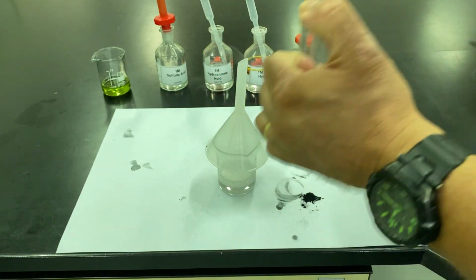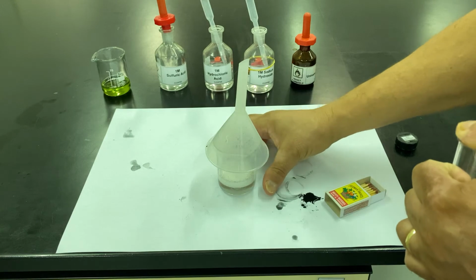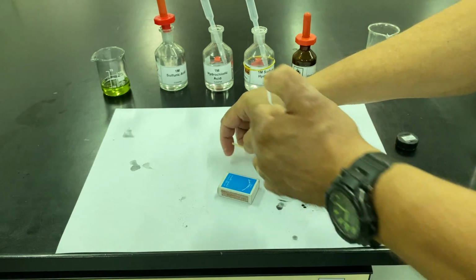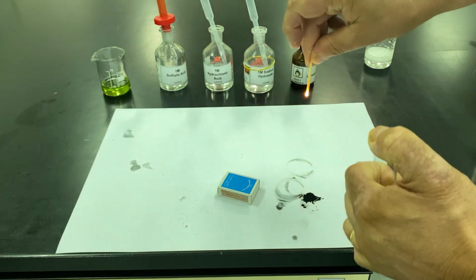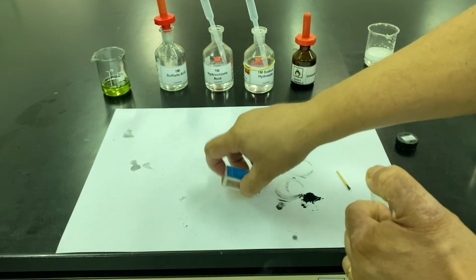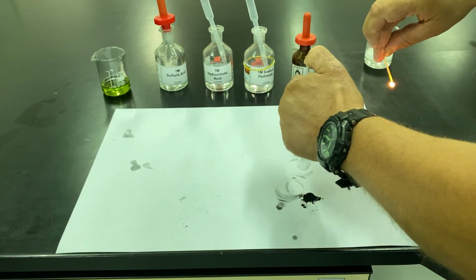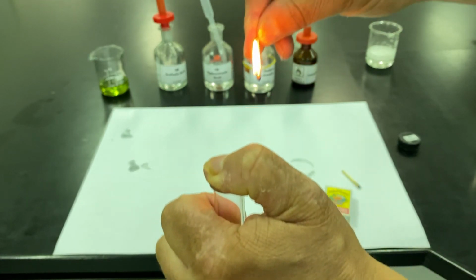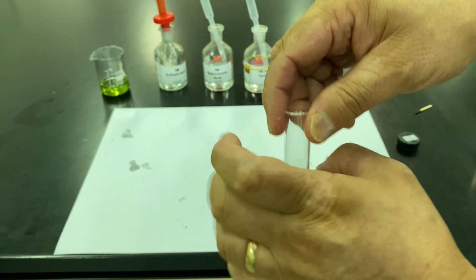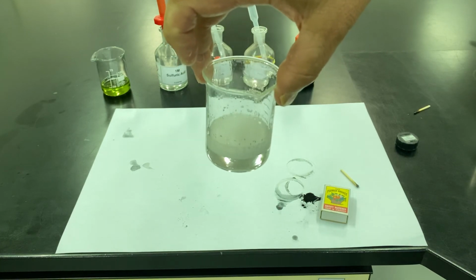Now, this is the famous Squeaky Pop Test. Move that to one side. Right, I need a flame from a match that doesn't blow out. Right, are you ready? So that's the famous Squeaky Pop Test, proving that that gas that was produced in this reaction was hydrogen gas.